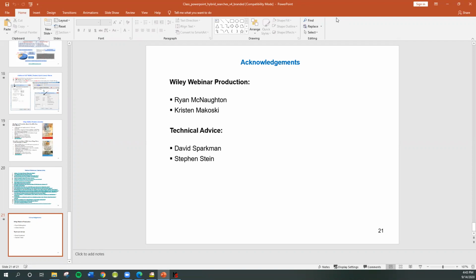I've mainly used it for confirmation work, quality work for Wiley and NIST, and it's wonderful for doing that because it just brings up examples that make me feel good that the new spectrum is the one that I want to say is good or not to go in the library. But I really feel if you have the delta masses, if you did chemical ionization, it doesn't really cost you any more to do the search because you can resort after you get through. If I was doing straight identification work now, I would be very, very excited because I think it's just such a big quantum leap in capabilities. So I would be surprised if you couldn't use it in your work.